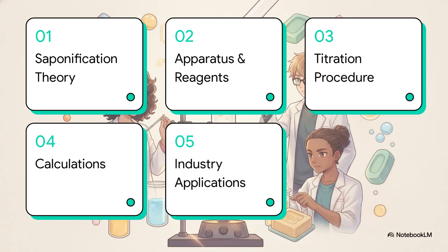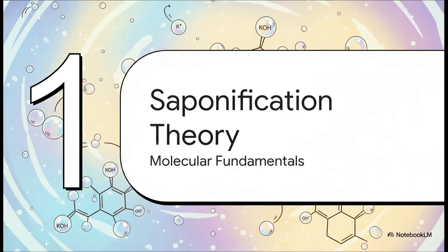Here's our map for today's lab tour. We're going to hit saponification and molecular theory, apparatus, reagents and safety, the back titration procedure, calculations and interpretation, and finally, industrial applications. Okay, Part 1, Saponification and Molecular Theory. Let's dive right into this.